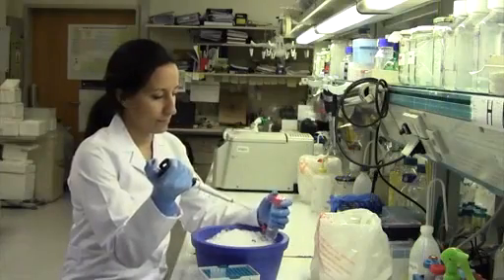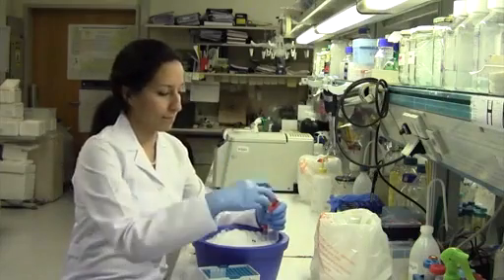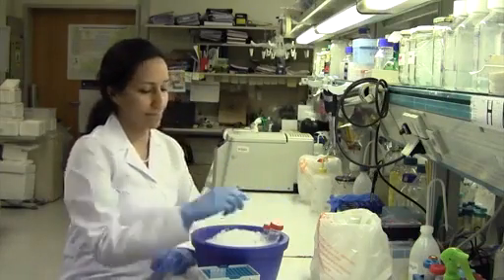There are several techniques to study autophagy. We are using molecular biology, biochemistry, and cell biology techniques to analyze different pathways that we are discovering. We are using immunoprecipitation, immunofluorescence techniques, confocal microscopy, and various other techniques to analyze autophagy pathways. Details of different techniques and pitfalls and troubleshooting will be explained by my PhD student, Secil Erbil.